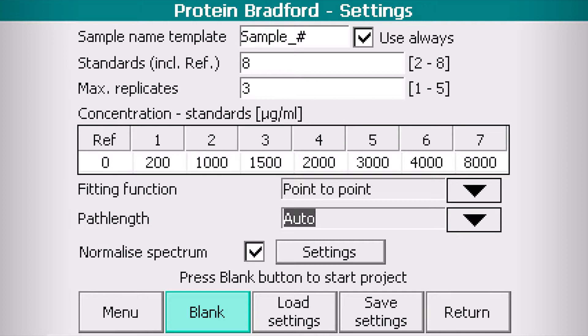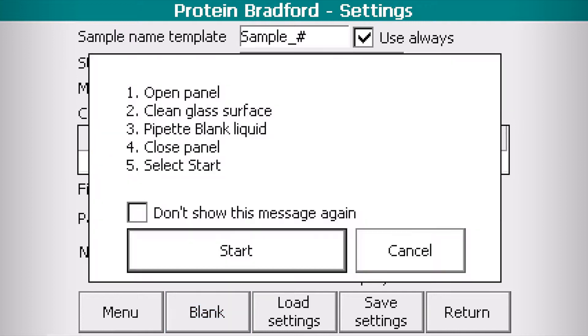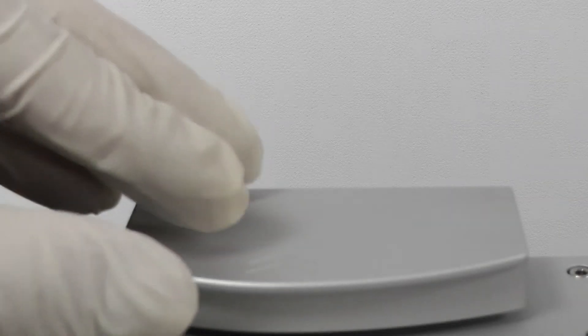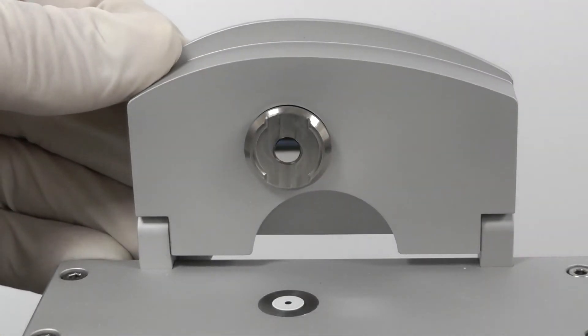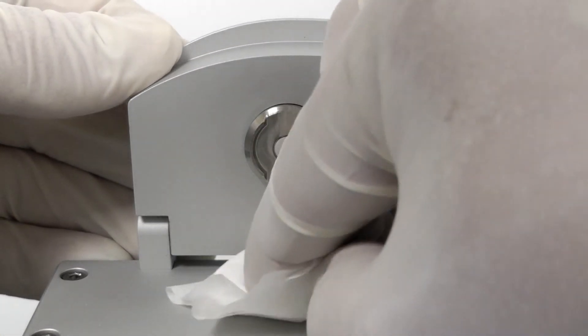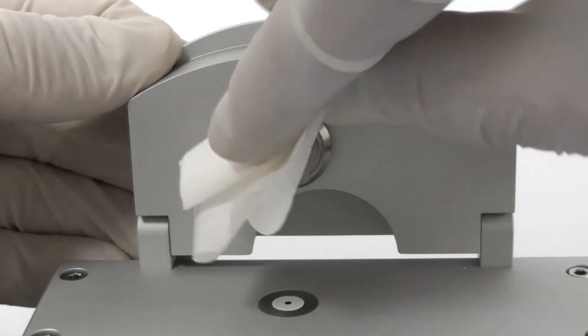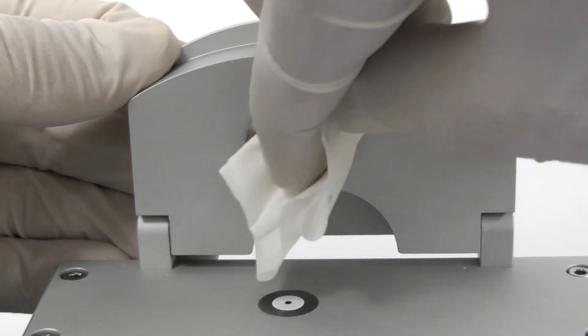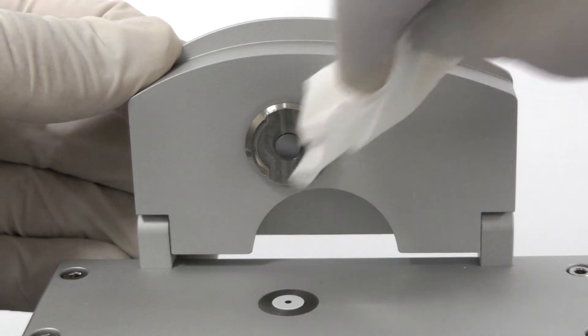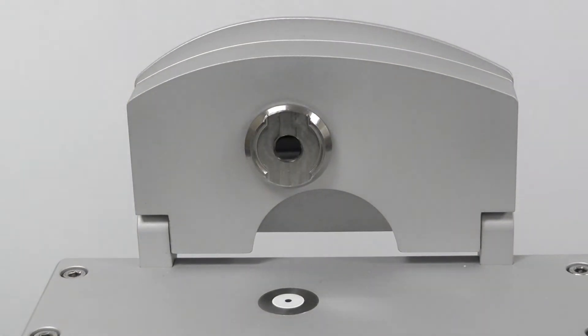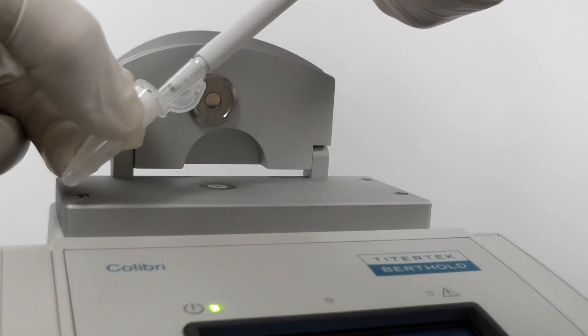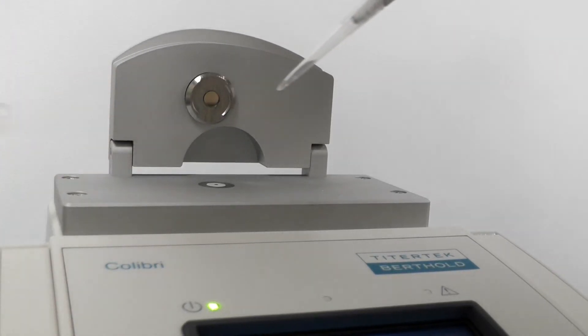Click the blank button. Open the panel. Clean upper and lower glass surfaces carefully using lint-free laboratory wipe. Pipette a drop of buffer and close the panel.